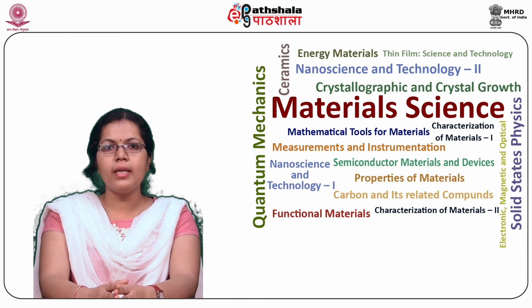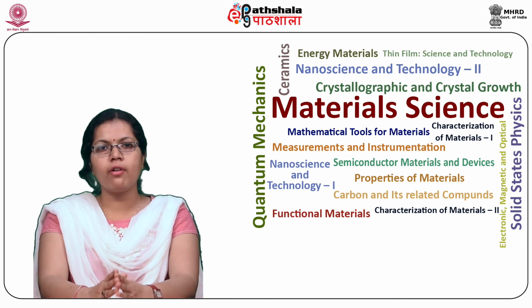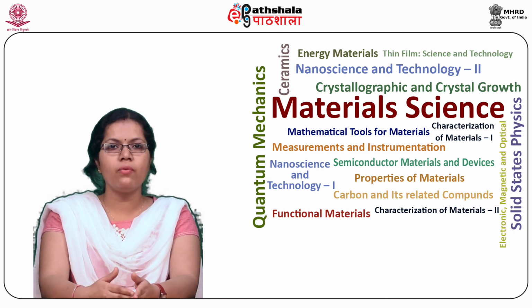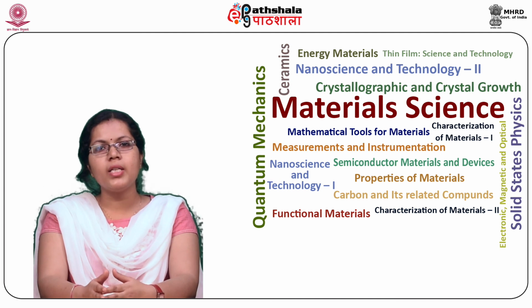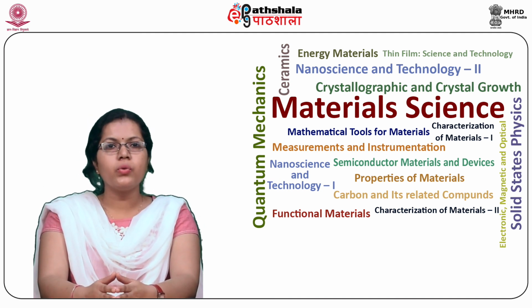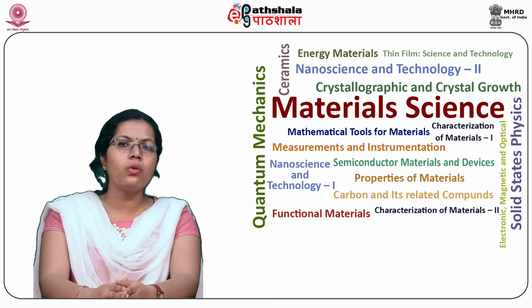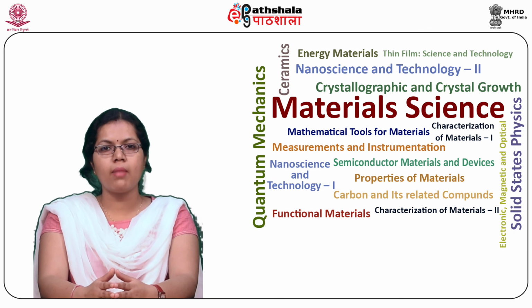Raman spectroscopy is employed for gases, liquids, and solids, making it an extremely versatile tool for examining diverse materials. Raman spectrum is characteristic to materials being studied due to their distinct structural arrangements. Therefore, the composition of unknown substances can be easily determined.